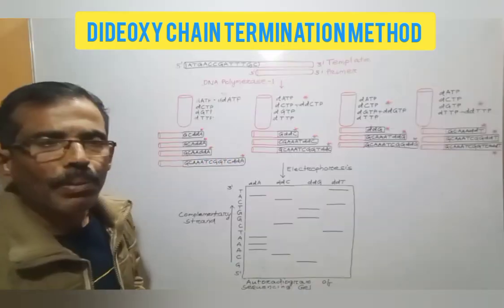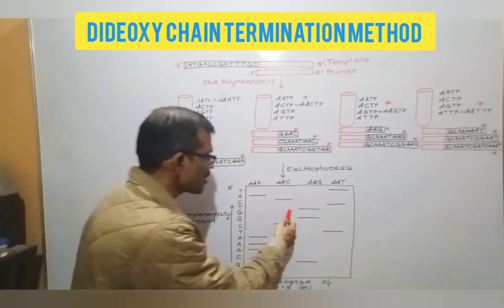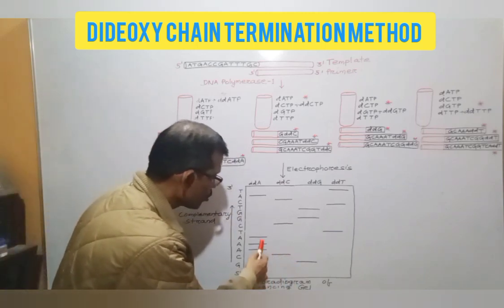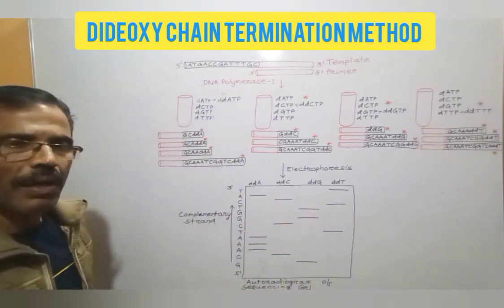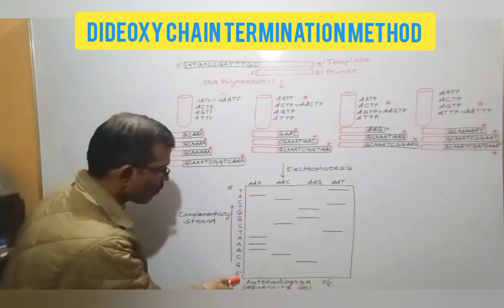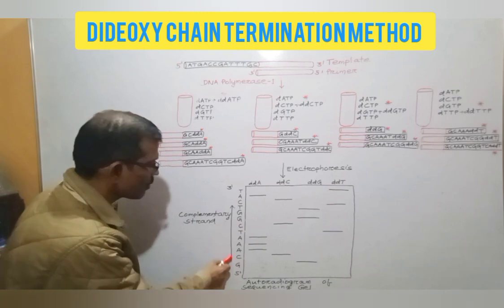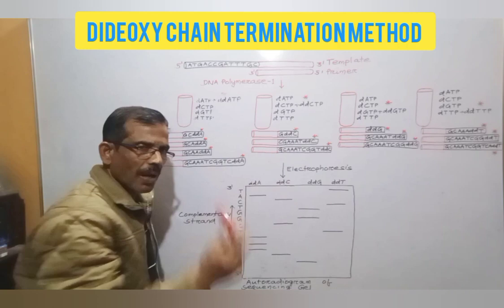Because the bands are radioactive or fluorescent, these bands can be visualized by autoradiography or by fluorescence. Based on the relative position of the bands in the 4 separate lanes, we can determine the sequence of the complementary strand, which is read from bottom to top of the gel in 5' to 3' direction. Based on the sequence of the complementary strand, the sequence of the DNA strand can be determined.